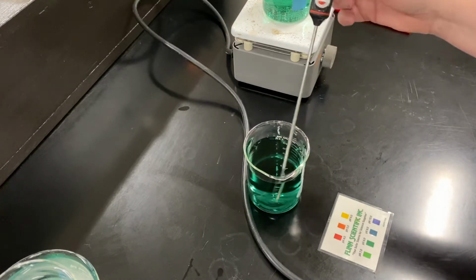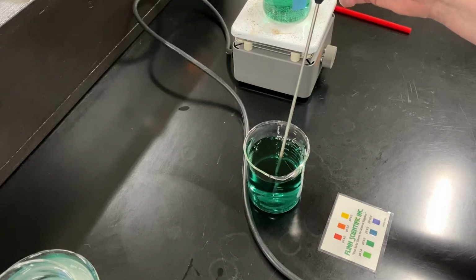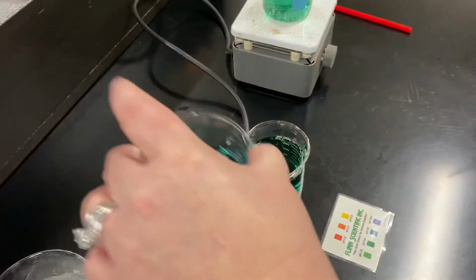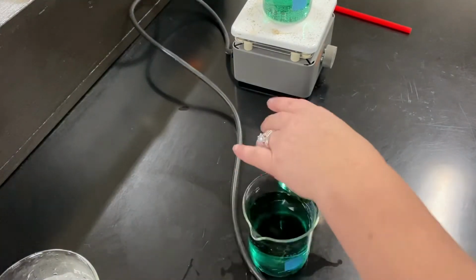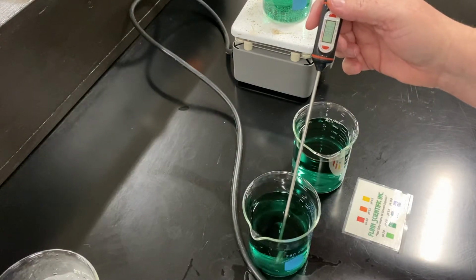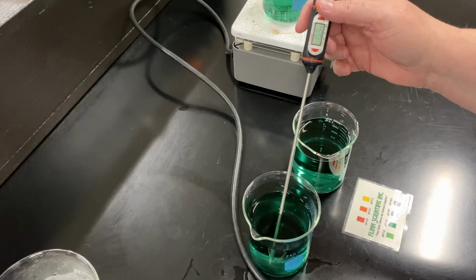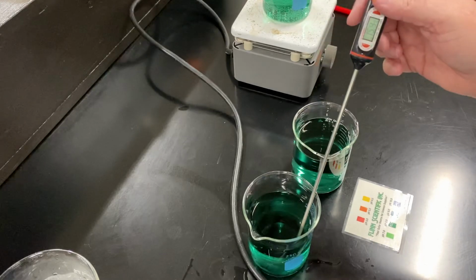Our room temperature water is at 28.6 degrees Celsius. You'll want to write that down, 28.6 degrees. Our cold temperature water, let's get these where we can see them. Our cold temperature water is at, just a second, it's still dropping. Looks like 15.4 degrees Celsius.